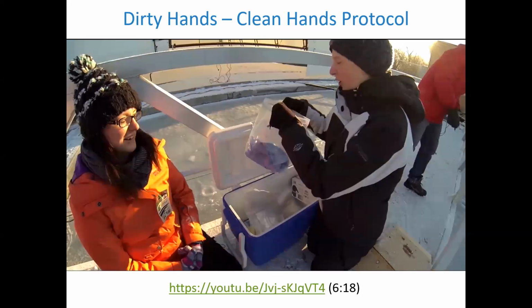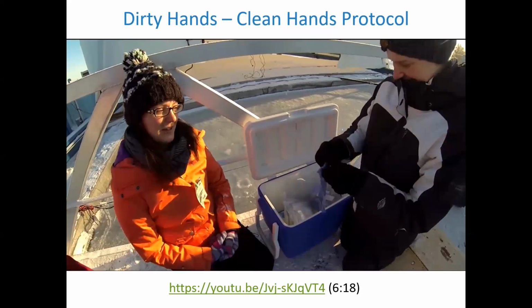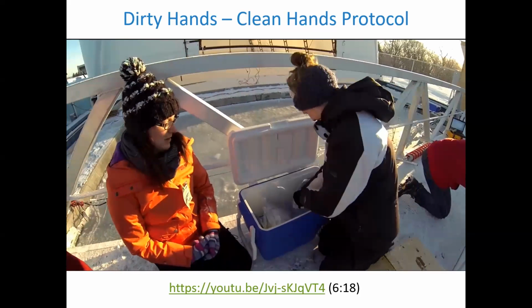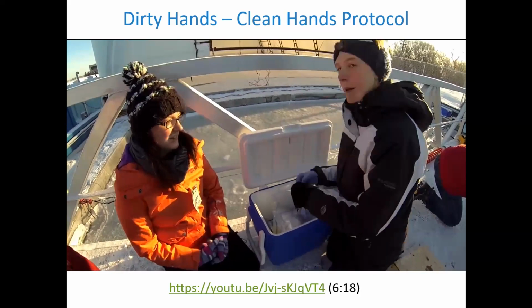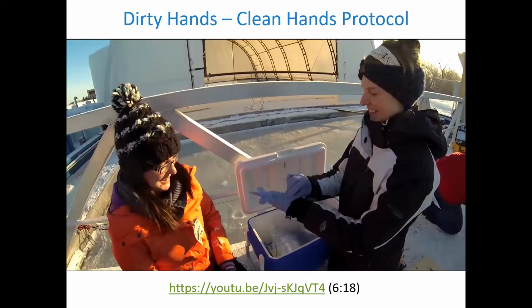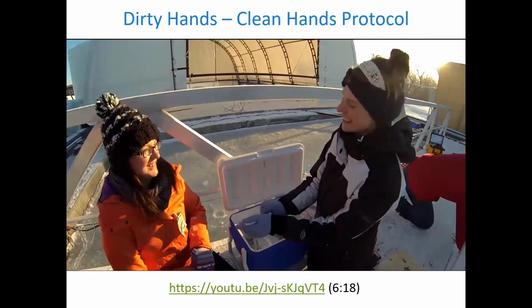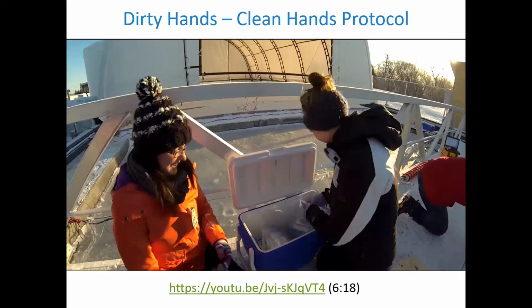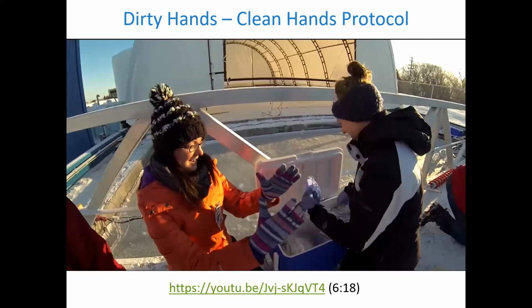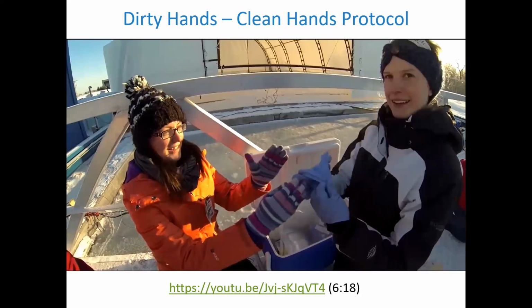Note that the gloves are all put in separate bags. So Sarah's going to start and put gloves on herself. And because I'm clean, I cannot put gloves on myself because I will contaminate them. Remember, Amanda only touches the sample bottles. Nice glovemanship. It's kind of like being a surgeon. It's true. Except it's colder here. Are you ready, Amanda? I'm ready, Sarah.